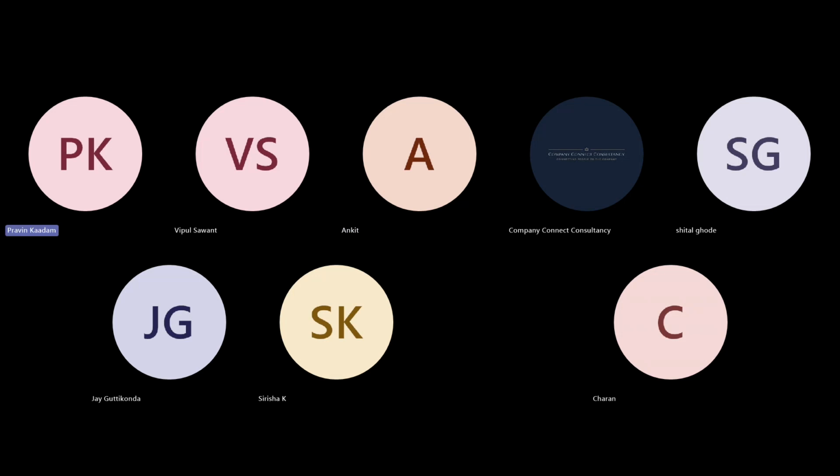Any other queries from anyone? Sir, I want to ask how we can merge LabWare with SAP. Suppose one company has some systems in SAP, like warehouse, laboratory, production. How can we merge? Okay, so you are saying that all the masters are already available in SAP, in the QM module, and now you want to implement LabWare LIMS.